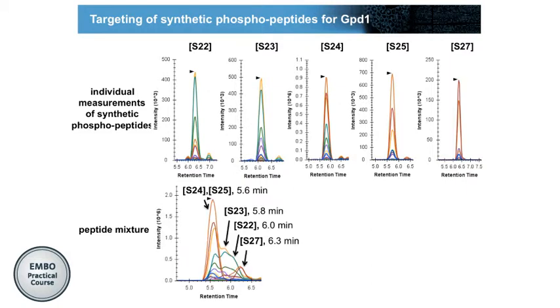So suddenly, these two seem to somehow coelute. This one looks a bit like a bump. This one, go figure out where it is, and this one, yeah, it's a bit of a mess. And this is also a very short gradient. It's at the beginning of the gradient, so maybe they will shift a bit in time. So trying to separate these is going to be hard.